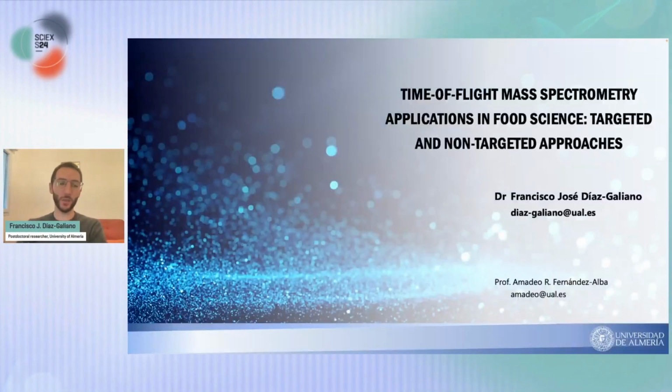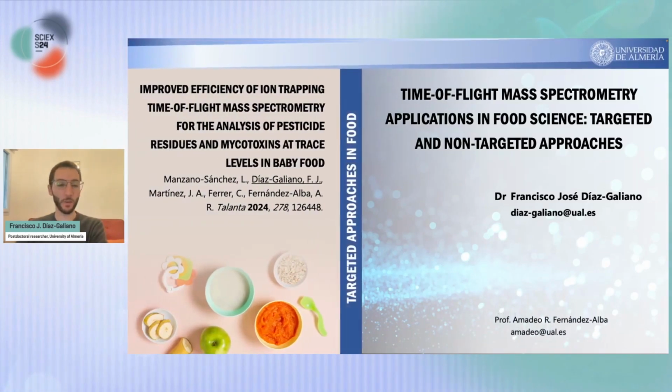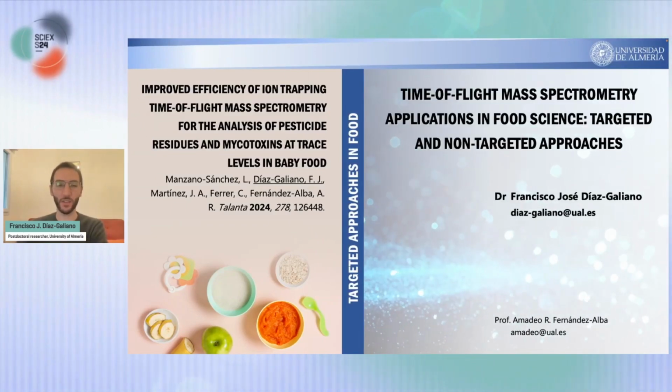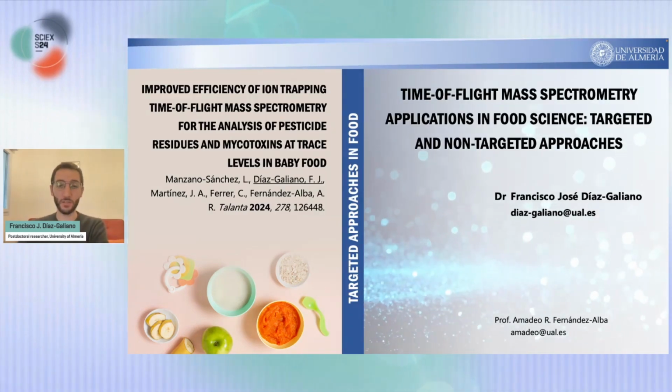The topic has been greatly introduced already. So I'm going to go ahead and start with the talk about the work that we developed in targeted and non-targeted applications using time-of-flight technology, both the ZenoTOF 7600 and the X500R. I'm going to start with the targeted methodology first.